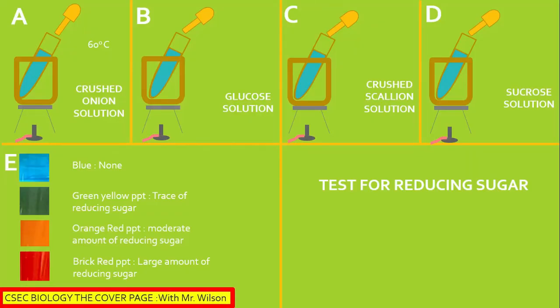Before we started this experiment, we actually heated the water. We added one drop of Benedict's solution and we are going to add another two drops to the test tube. We want to ensure we maintain that temperature above 60–65 degrees Celsius thereabout. So we're going to apply a little more heat — the tube is placed in a hot water bath.